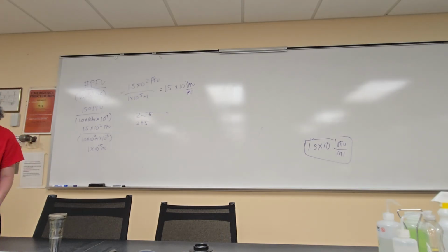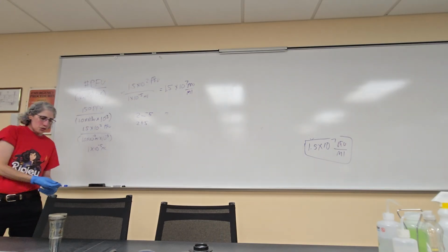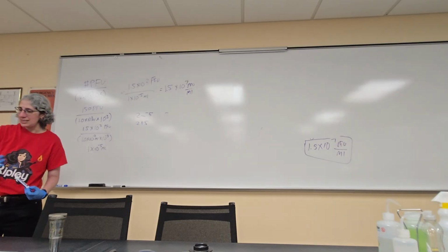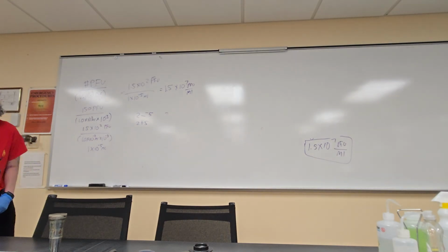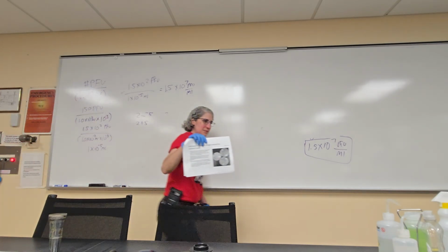In the end, what we want to do is create the webbed plates, right? Meaning that the majority of the bacteria is going to be destroyed. You'll have these wisps of bacteria present, so it's mainly virus on the plate, okay? So we have to figure out how many plaques it is going to take to create this webbed plate, okay? So in my example, I have the example of the webbed plating on here.